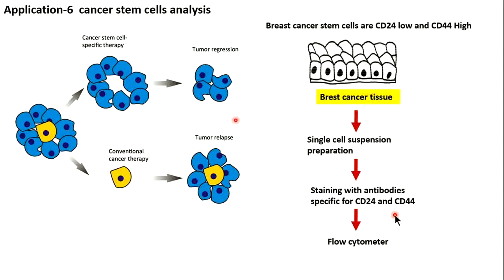Now, application 6, one of my favorite. Right. Can we analyze the cancer stem cells? And people are doing it. And this is one of the landmark analyses by which cancer research is progressing very fast now.